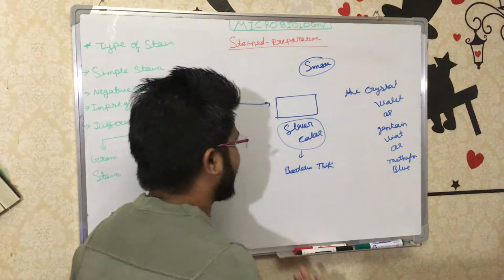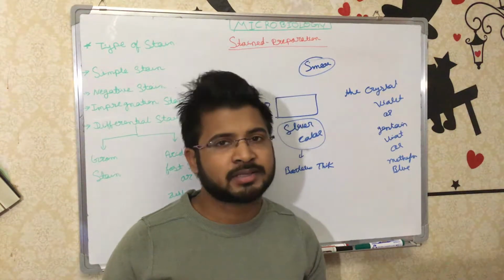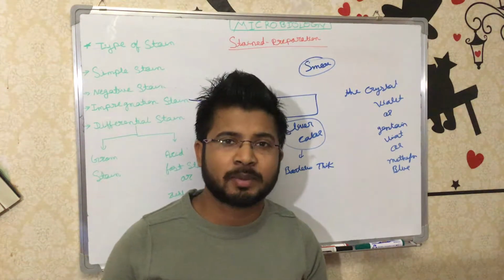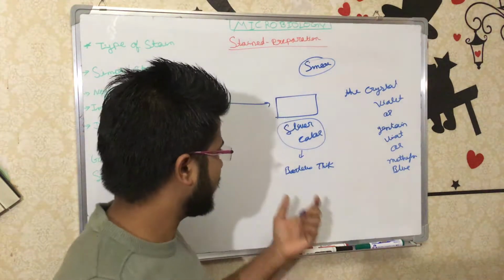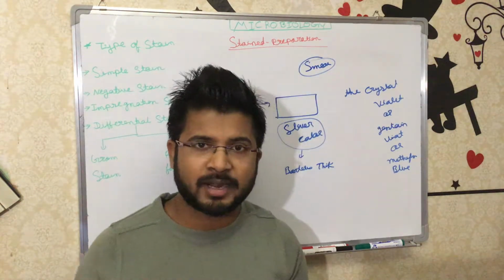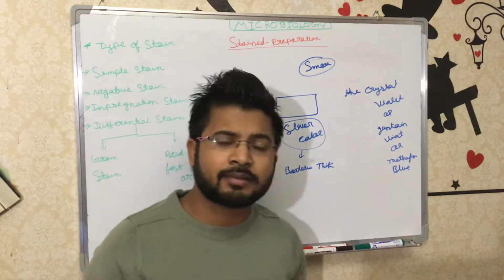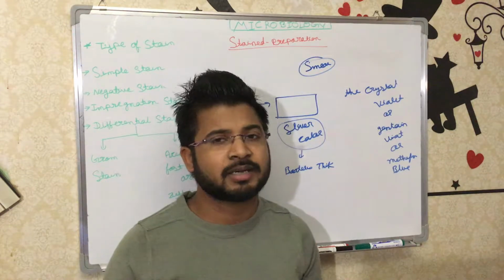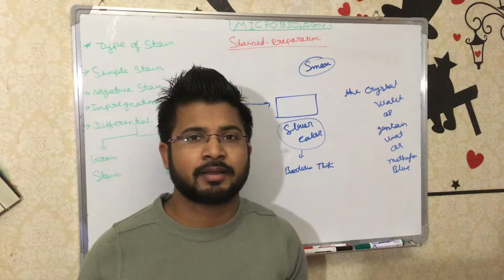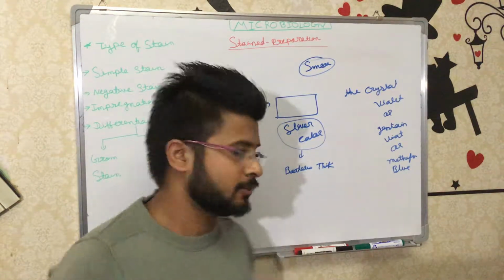So by this method we can identify or determine the flagella of the bacteria. But this is also not successful. For example, in a spirochete species, just take Treponema pallidum, the causative agent of syphilis. If we take the bacteria on the slide and put the silver color, we can demonstrate that this bacteria is Treponema pallidum. But as an exception, if it is another bacteria, we can't identify it. So by this method somehow we can identify the flagella of the bacteria.